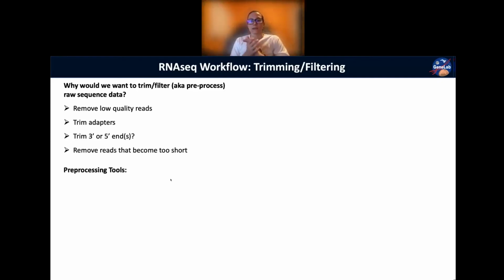I'm wondering because of anything concerning. Oh yeah, that's right. A lot of you are microbiologists. So Susie mentioned, Mike, that singletons can be concerning in 16S amplicon sequencing if you just have one copy of a region, because you amplify one very specific region that you're sequencing for 16S. Mike, if you want to unmute your mic and explain why that's an issue in amplicon sequencing, you'd probably do a better job than I can.